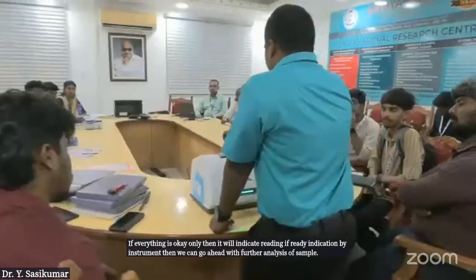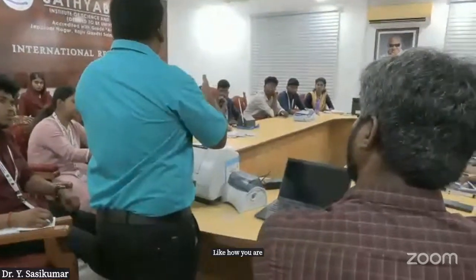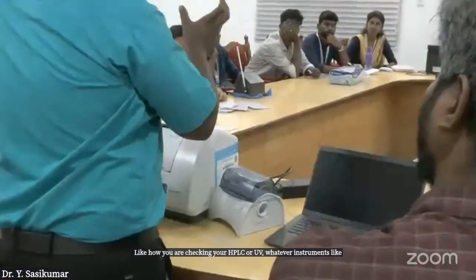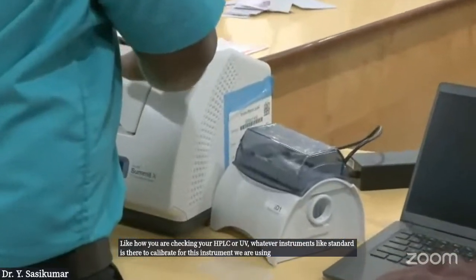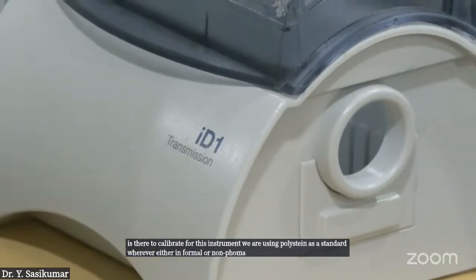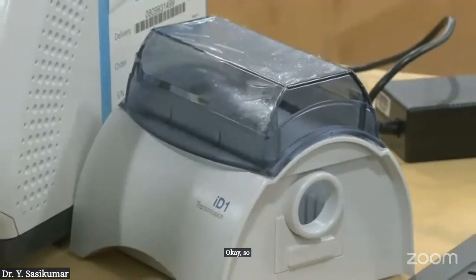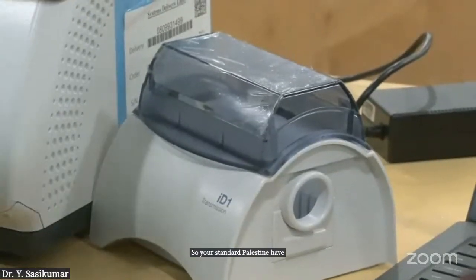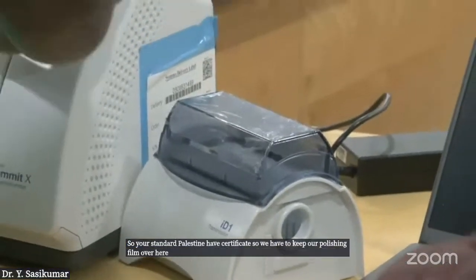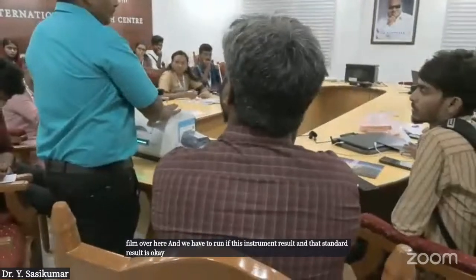For this instrument, the standard is polystyrene film, like how you check your HPLC or UV instruments, no? There is a standard to calibrate. For this instrument, we are using polystyrene as a standard, whether in pharma or non-pharma. Your standard polystyrene comes with a certificate. We keep our polystyrene film over here and run. If this instrument result and that standard result are okay, then the instrument is okay. Likewise only we are calibrating this instrument.